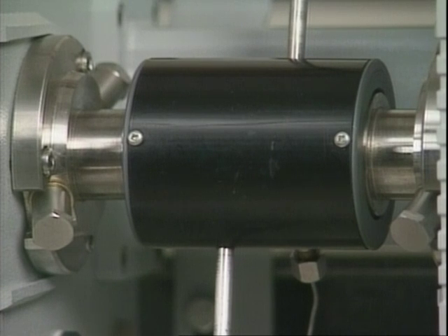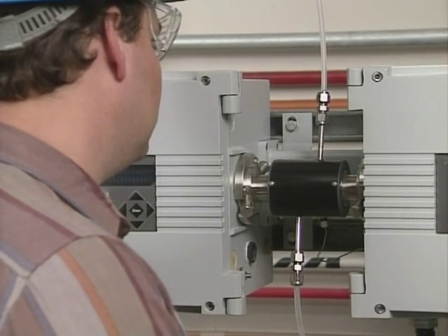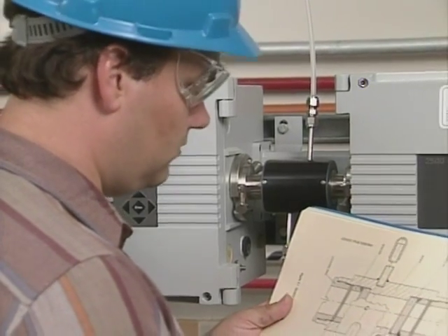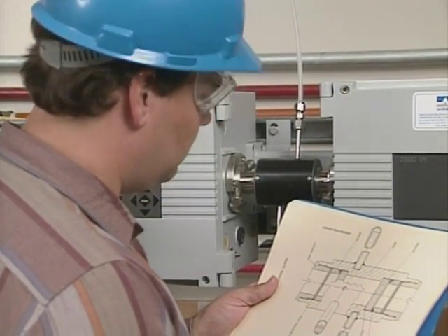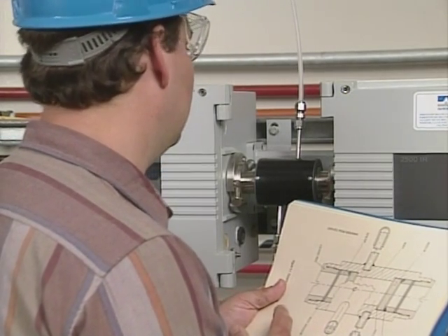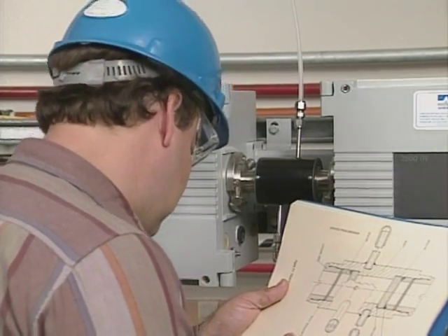Sample cell construction varies according to manufacturer and process specifications. The following demonstration shows some typical procedures for a single beam infrared analyzer. Symptoms of a dirty sample cell are low gain, erratic output, or drift. Some cells are heated, and if the heater control is faulty, it can cause drift.